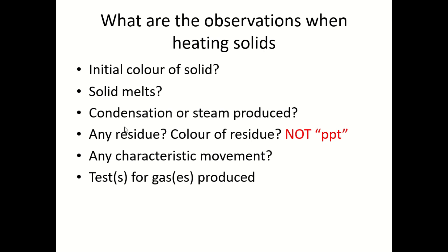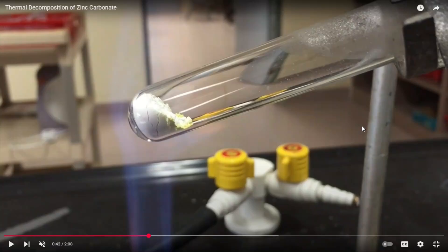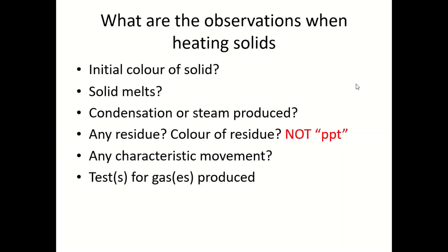The third question would be is there condensation? This is another video showing thermal decomposition of zinc carbonate. You see that there are water droplets near the top of the boiling tube. This is actually condensation of the steam that is produced from heating the solid. If you observe something like this, please write down condensation upon heating.